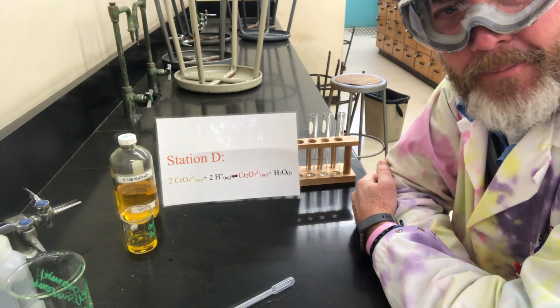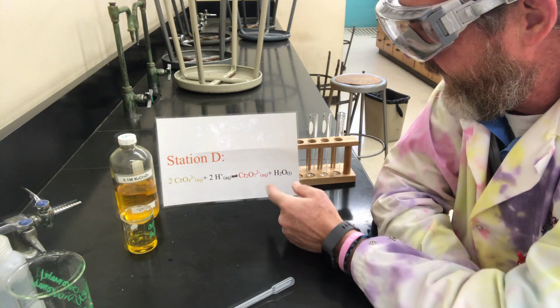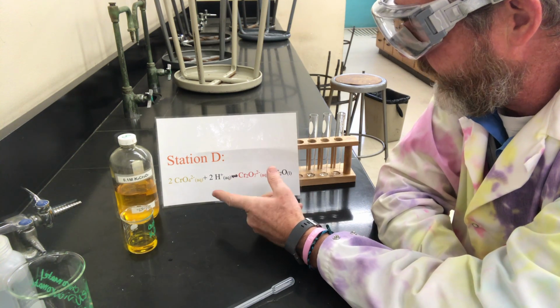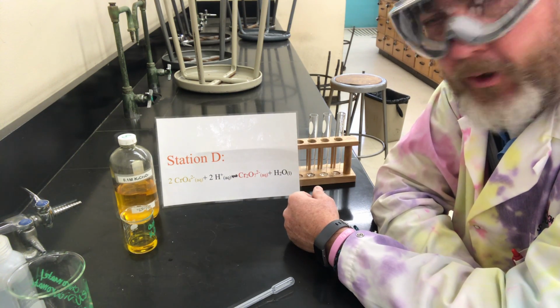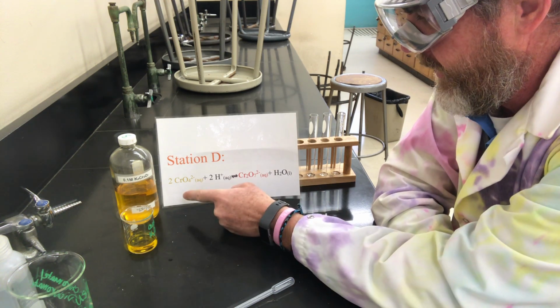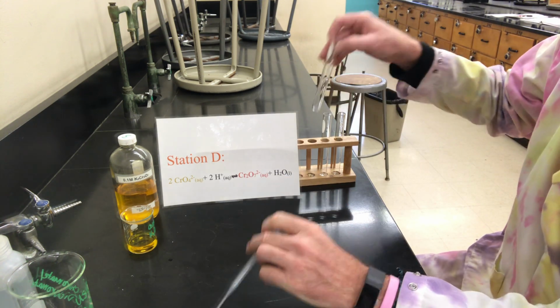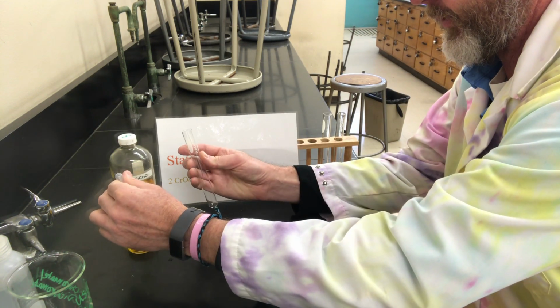Okay, part D. We're going to take a look at potassium dichromate, and we're going to see what happens and how we shift this equilibrium. Now, dichromate is more of an orange color, and the chromate is more of a yellow color. So we're going to start off with our first test tube.